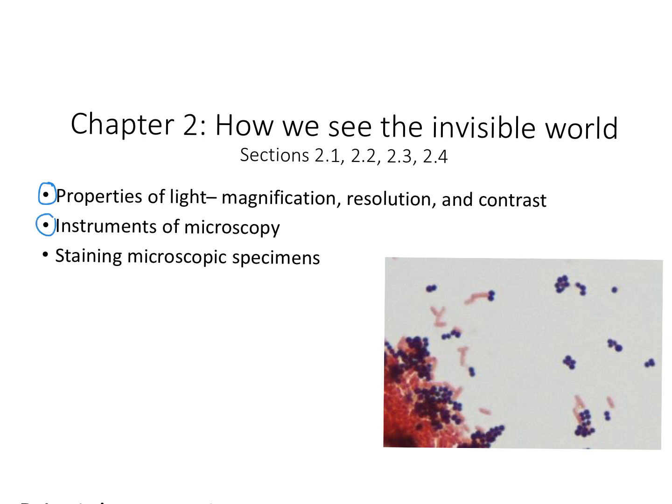We're going to talk about some of the most popular kinds of microscopy out there and a little bit about staining. That's going to be some overlap with lab, of course, but I wanted to expose you to that, those of you that are not in lab. And again, if you are, it's good to hear something a couple different ways, hopefully.